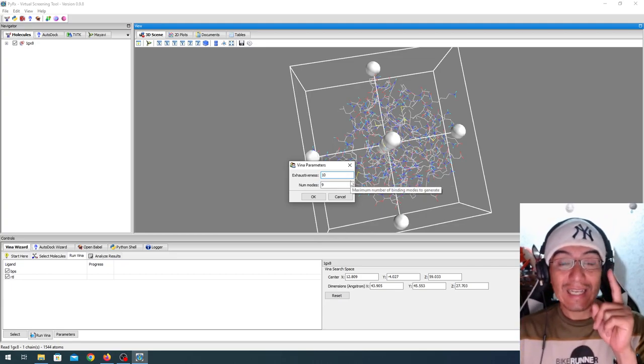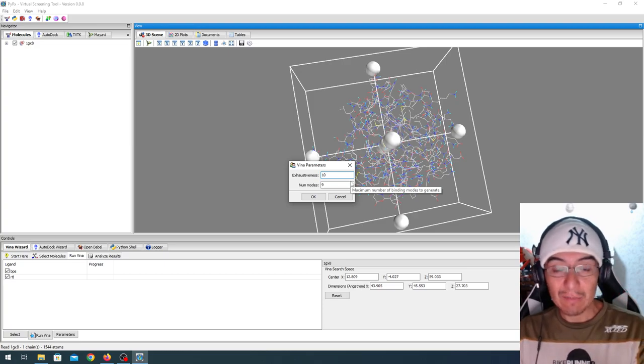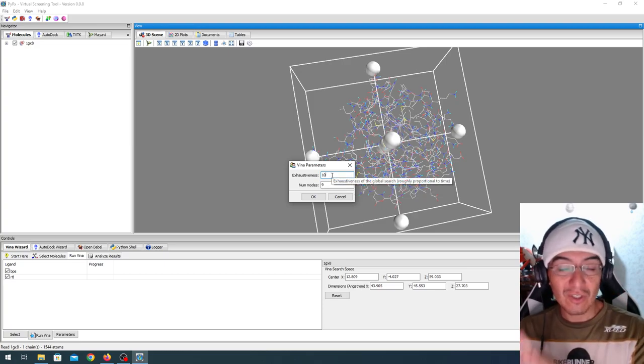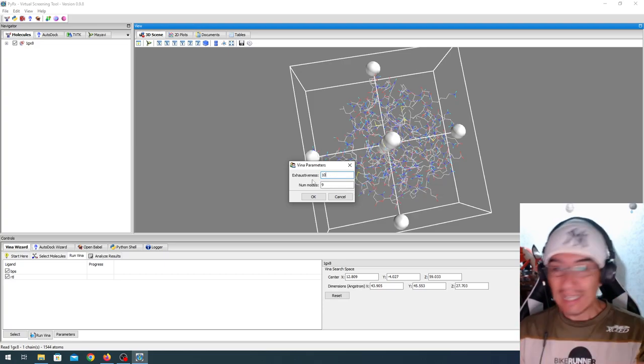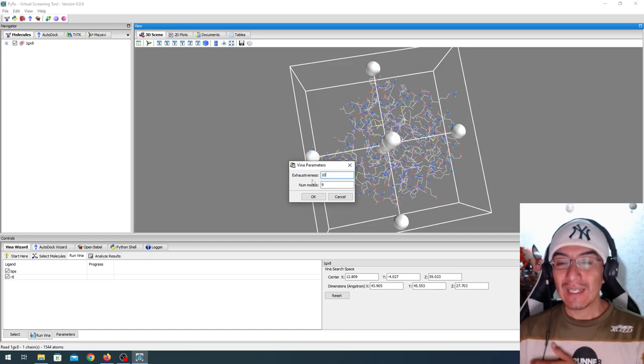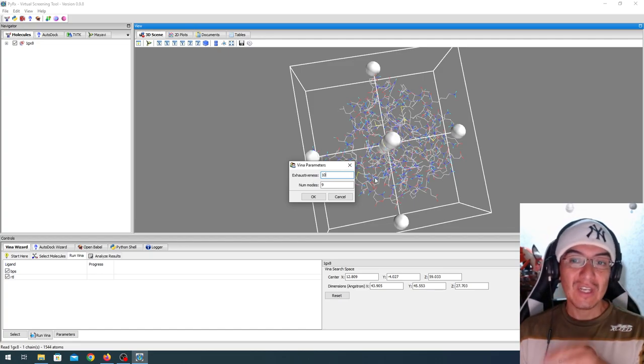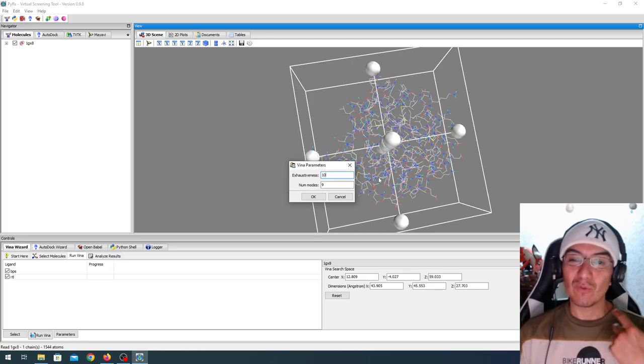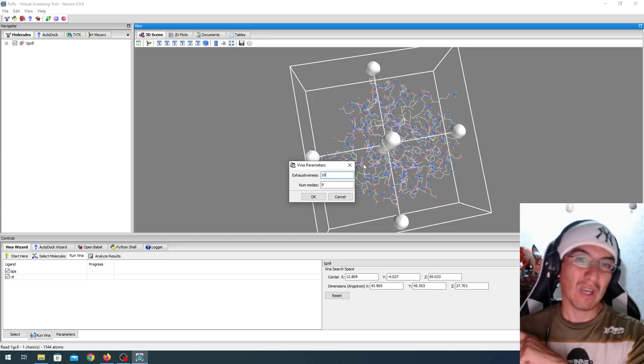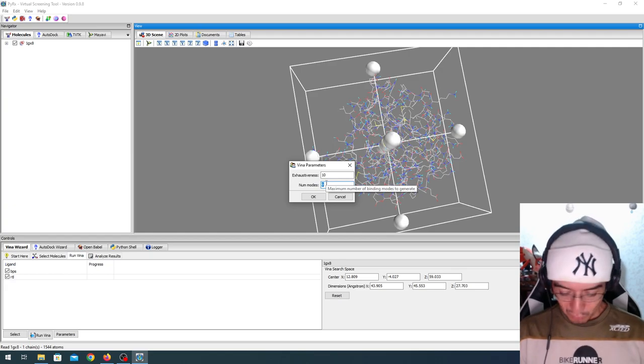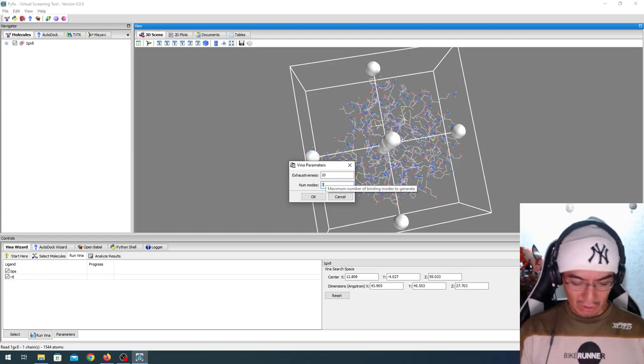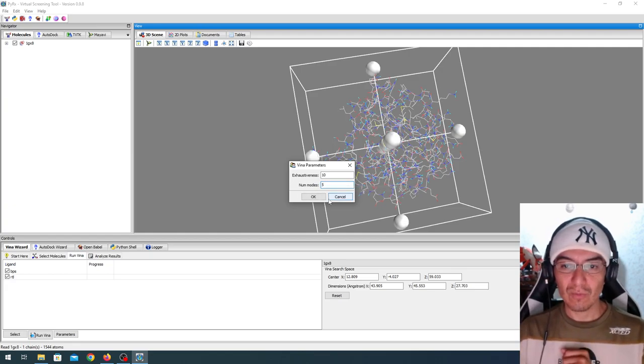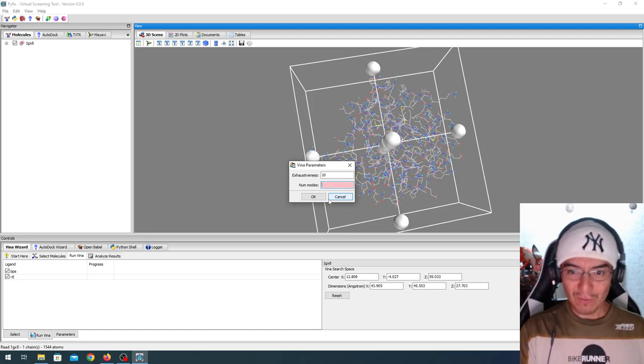Notice, if you run Vina inside Chimera, your maximum exhaustiveness is going to be 8. 10, I think it's the minimum. If I was to run a screening or something more important, I would probably go for 100 or 500, but using a cluster. And I'm going to go for 3 for the number, you know, 5 for the number of modes, or 10. Let's go for 10.